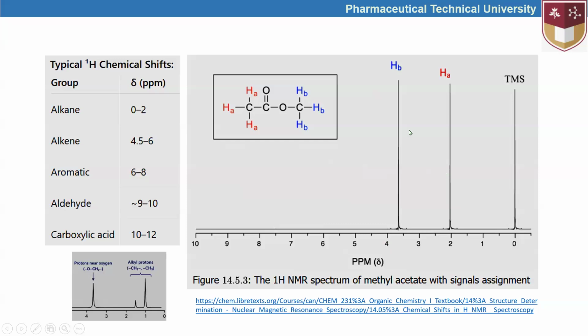Okay, because these signals require more frequency of radio waves that have higher energy because they have lower electron density, and as explained, as we go far from zero, we see lower and lower electron density of the hydrogen atoms. I hope now you understand my points of view.